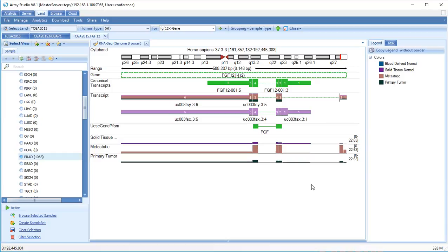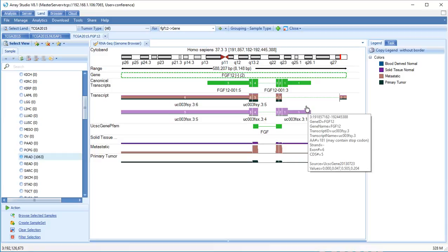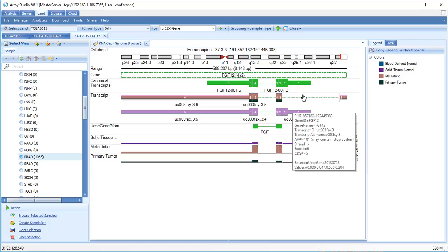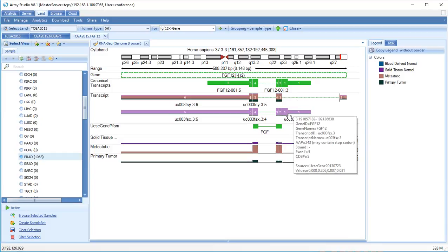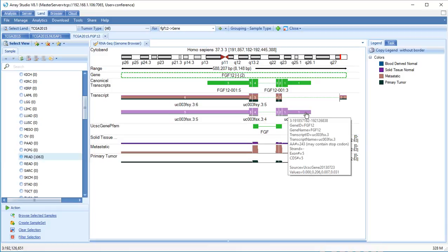Now look at the transcript usage track. This displays the distribution of each transcript in sample types. This shows that tumor samples tend to express one transcript, while normal samples express a different transcript.